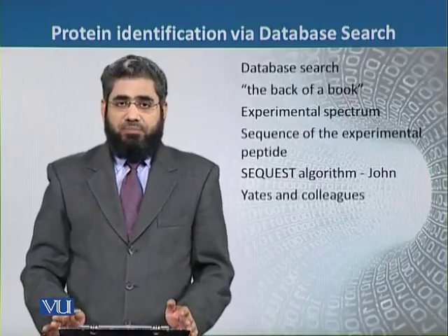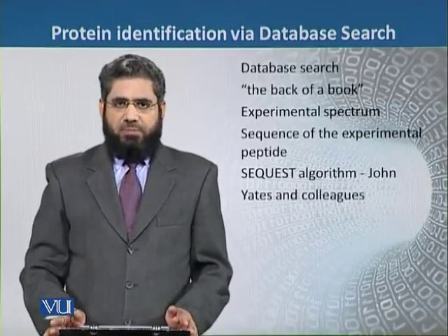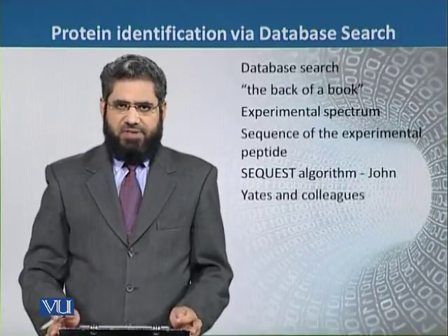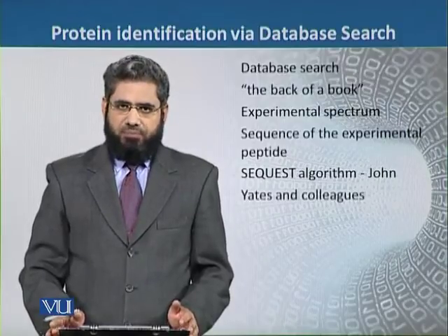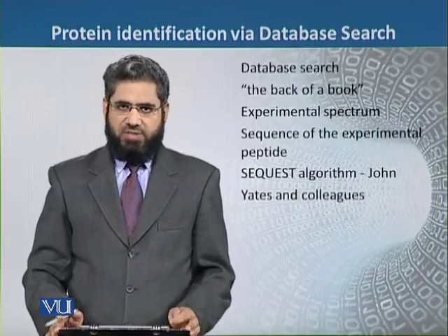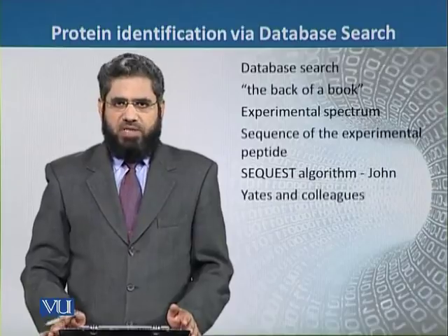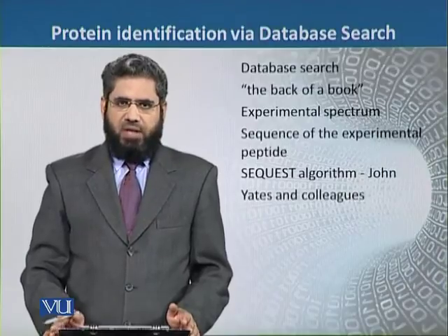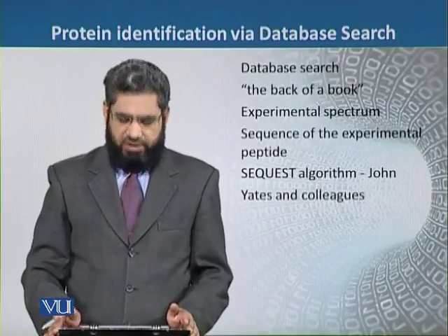So the best solution, meaning the best peptide sequence, will be the one that matches the peptide present in the database. Working on this approach, an algorithm known as SEQUEST was developed by John Yates and his colleagues. The function of that algorithm was to find the best possible sequence generated from the experimental data and compare it with the already present sequences of proteins in the databases.